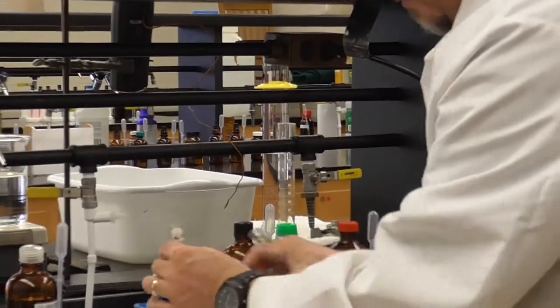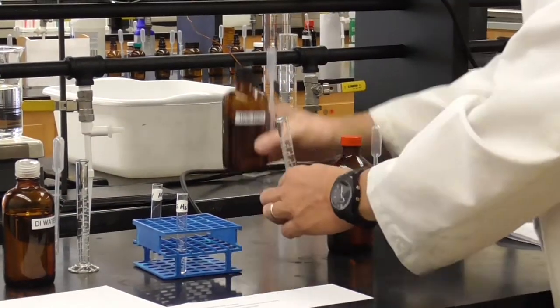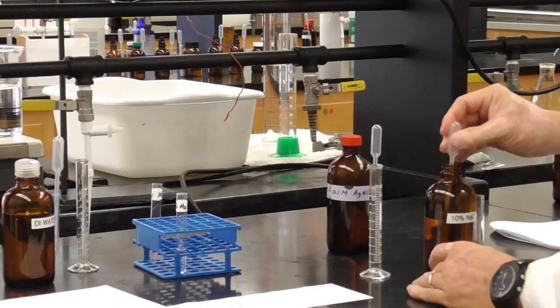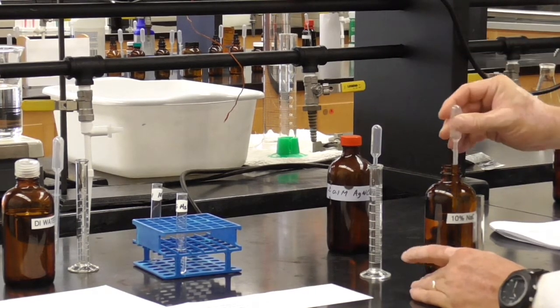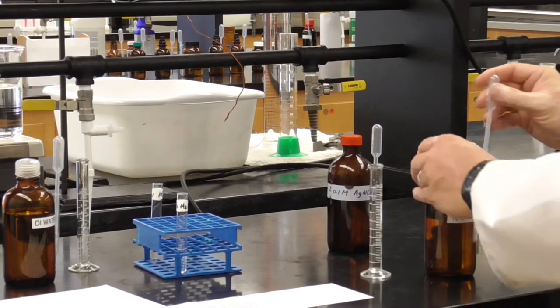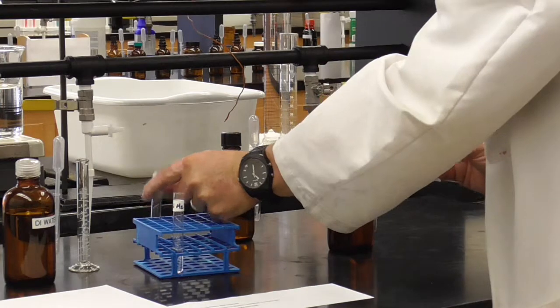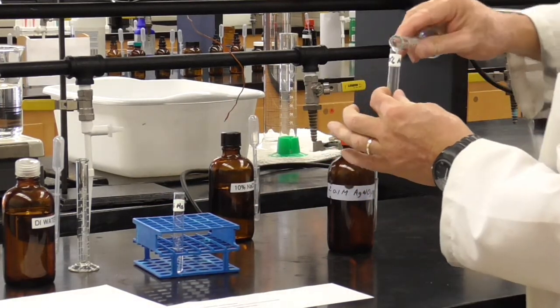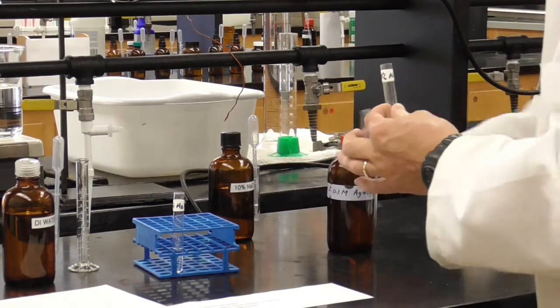I'm going to put this right up front so we can see it easily. And our positive control, sodium chloride, 10%. Again, we'll get 3 milliliters of it. Good. And pour that into the second test tube, properly labeled 10% sodium chloride. Always label your bottles and your test tubes so you know what's in them.